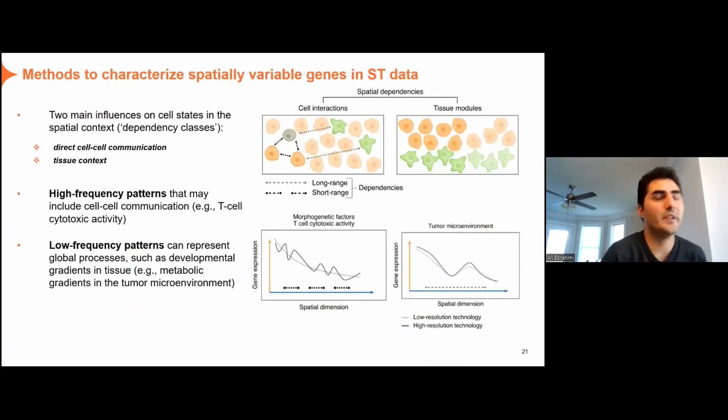Now, very briefly about some bioinformatic tools that are being used to analyze the spatial transcriptomics data. I think the first thing is really understanding what we want to visualize or what we are going to report in terms of the endpoint for these sort of data.